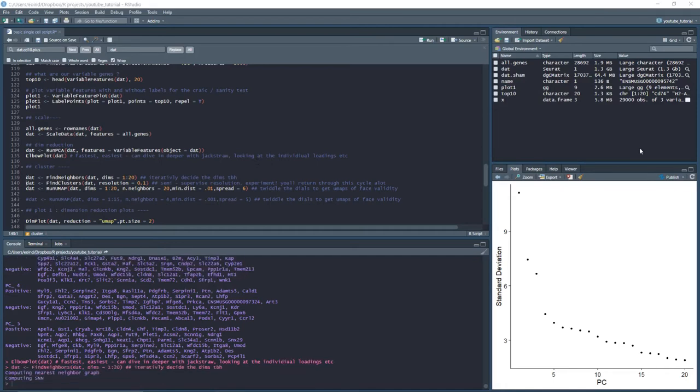The next step then is to find the clusters or communities that exist within this graph that we've just constructed. The default method here is a Louvain algorithm, and what that does is it tries to optimize the modularity of the clusters it identifies within that graph. The bar stool explanation of modularity, because I'm not a mathematician, is that it is one way of measuring the structure of a graph and of the clusters within it. It's a way of measuring the strength of partitioning into those individual clusters, and a high modularity means that they're tightly knit and different from each other.